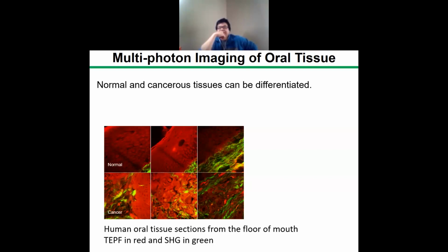Yeah. But actually, the biomedical problem is so complicated. That's why you cannot just rely on one modality. You like to combine all these. For example, multi-photon, confocal, and targeted, label-free, all these modalities to study one question. That would be ideal. That's kind of a dream case for all the imaging system developers. They are not limited to one modality. So later, maybe we can integrate OCT because sometimes OCT can see the blood vessel, or you can integrate the photoacoustic to see the blood vessel.